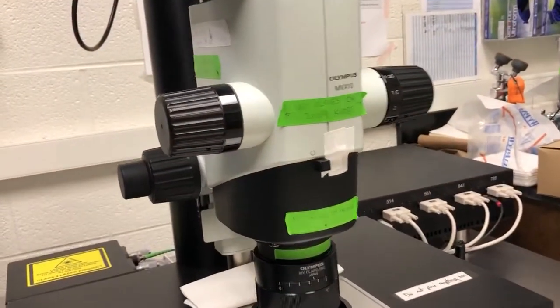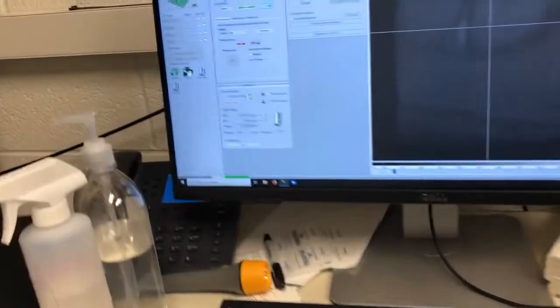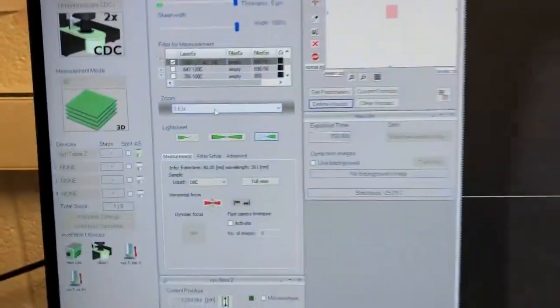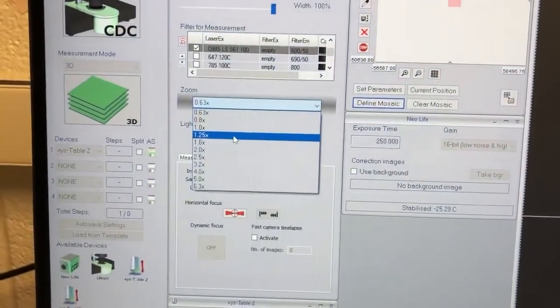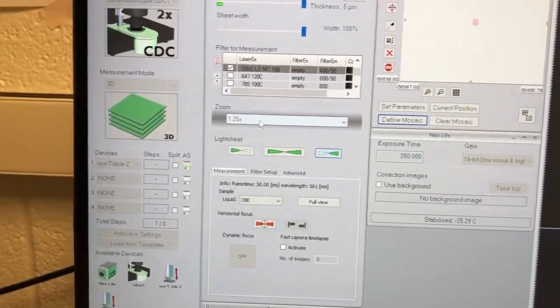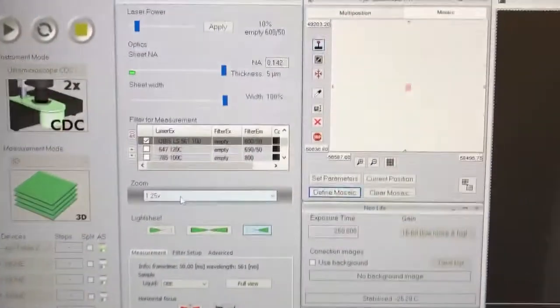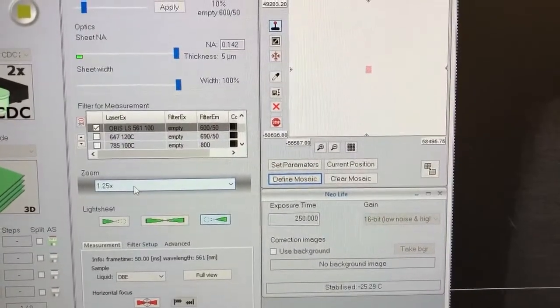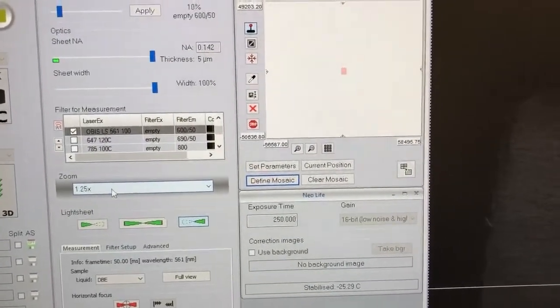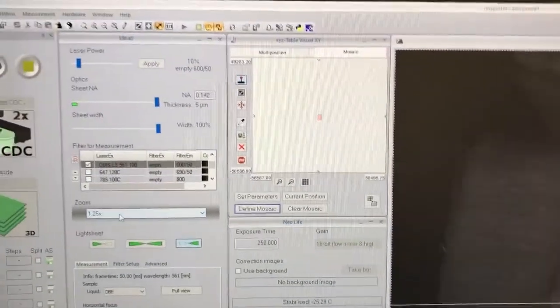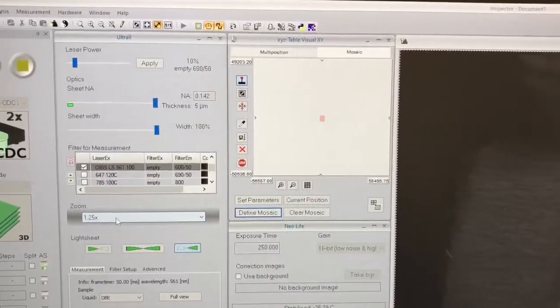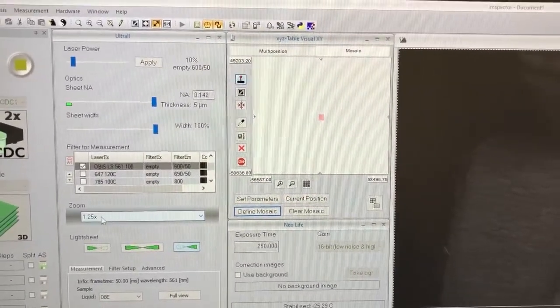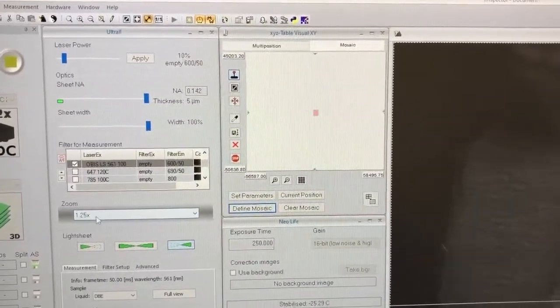Once you've decided on a particular zoom — for example, now we're at 1.25 — you need to tell the software what zoom you're at by clicking here. This is super important because it not only affects the metadata, it also affects how the software reports the sheet shape to you. So it's really important that whenever you change the zoom, you change it here as well.